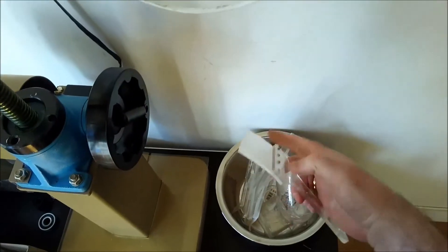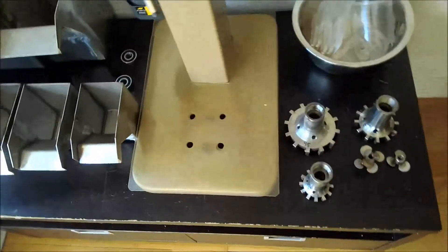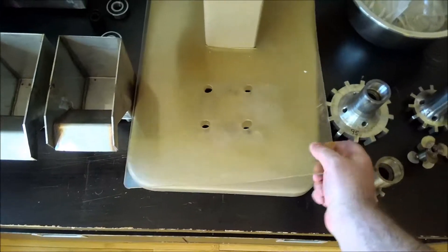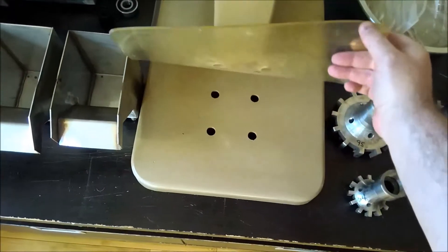Me, I'll just use this little one here. The base is a nice polyurethane kind of carpet.